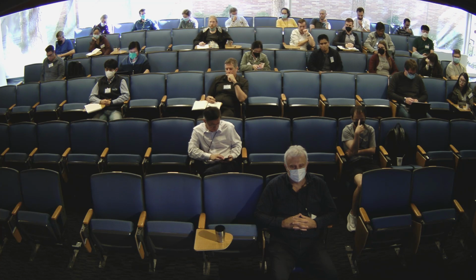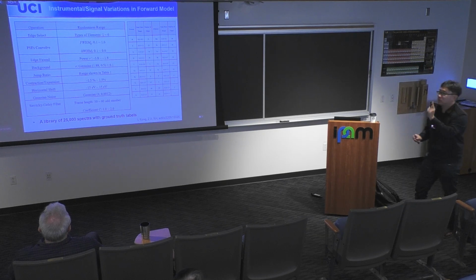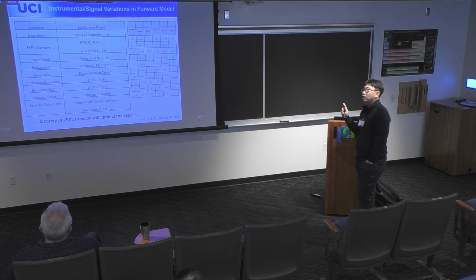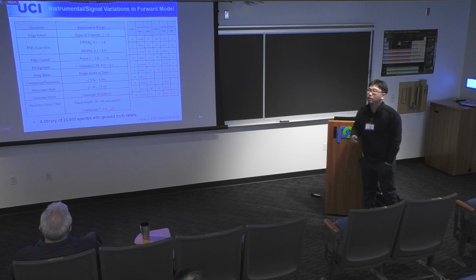This is the thing we can discuss. Let's look at some spectra, and you will find that the standard deviation of the noise actually doesn't change much with the counts, unless we really get into the regime of DDD. Here I'm creating this primarily for general electron microscopy users who are still using the old instruments.